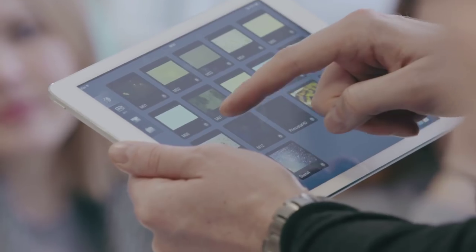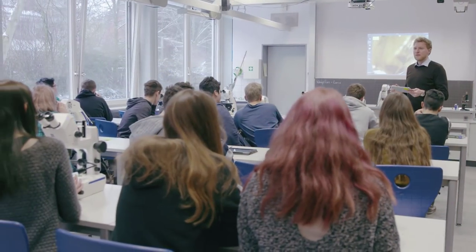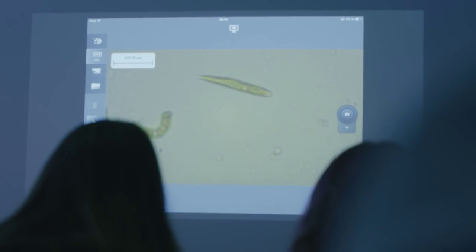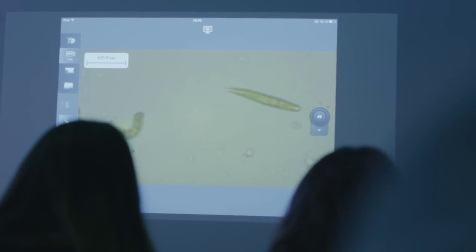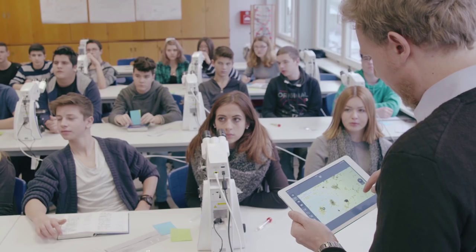The interconnectivity of these microscopes has some decisive advantages for me as a teacher. On the one hand, it is possible to project what a pupil is looking at onto the screen at the front, so that everyone can see this microscopic image.